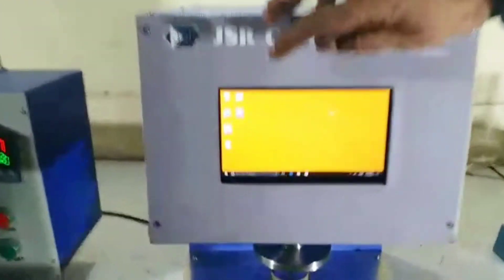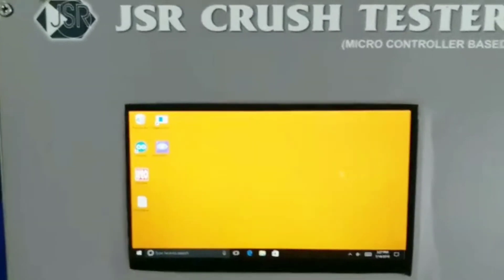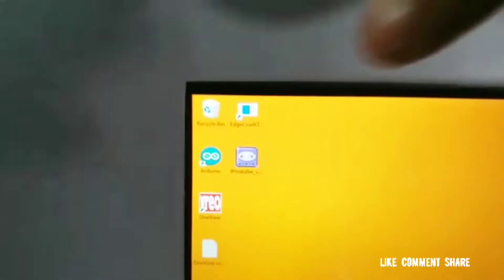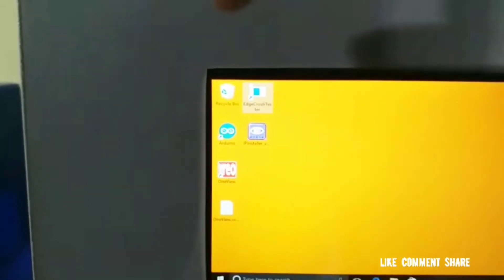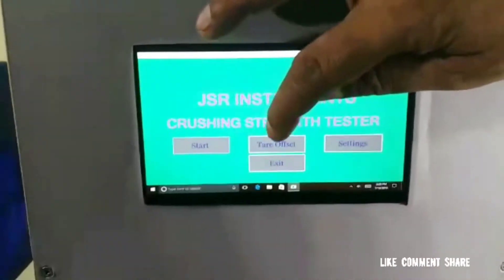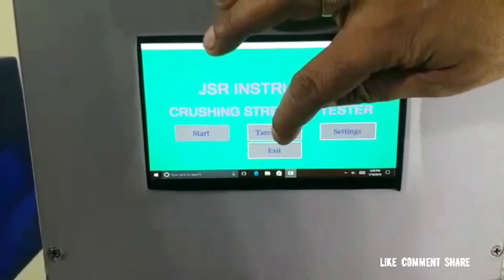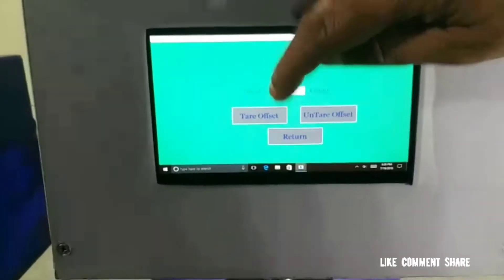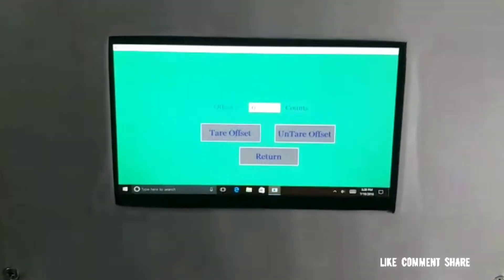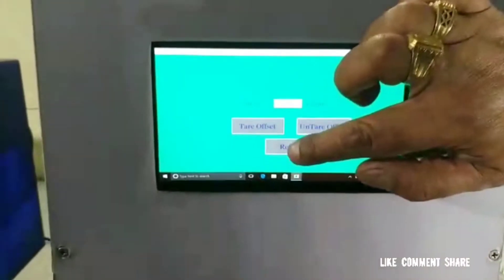This is the front panel of the crush tester. There is one icon named Edge Crush Test. We can make a double click on this. Initially, we make the offset zero. This is the tare offset — we make it tare zero. Now the machine is ready to test.